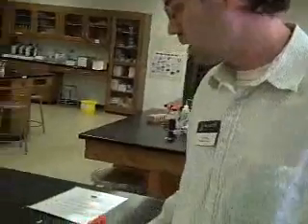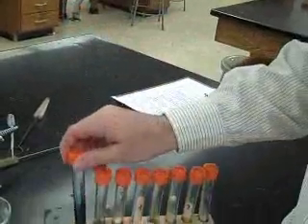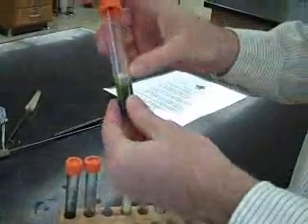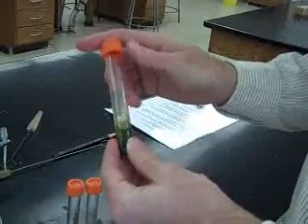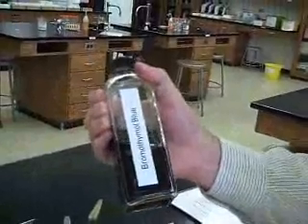So let's look at the results we got for our experiments. In each of these tubes, we have a glass tube of the sugar along with some yeast, and it's suspended in bromothymol blue. Our bromothymol blue at neutral pH is green. When it becomes acidic, it turns yellow.